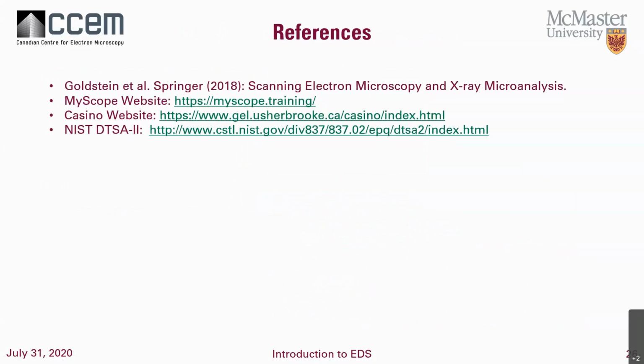So two things I will point out. Goldstein's sort of the Bible of scanning electron microscopy and microanalysis. The Australian MyScope website is extremely good. I've used that for a lot of the source material, so thank you to them.